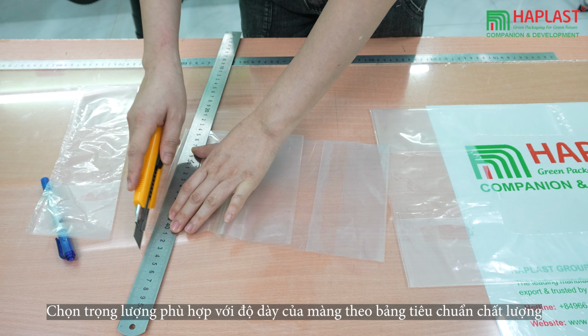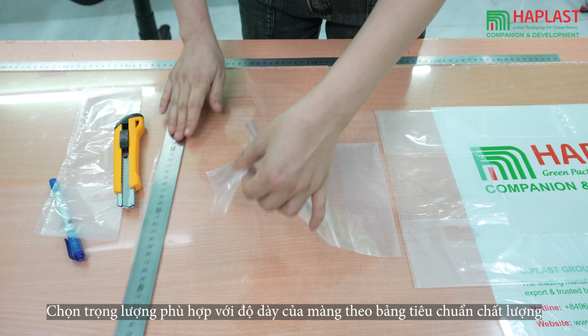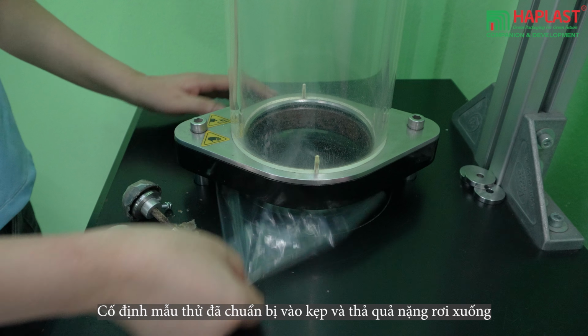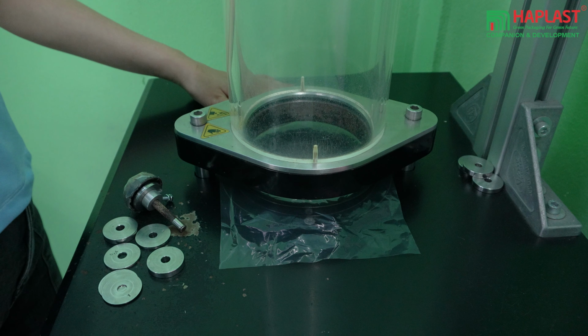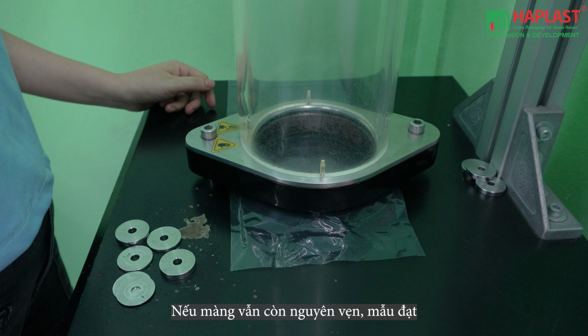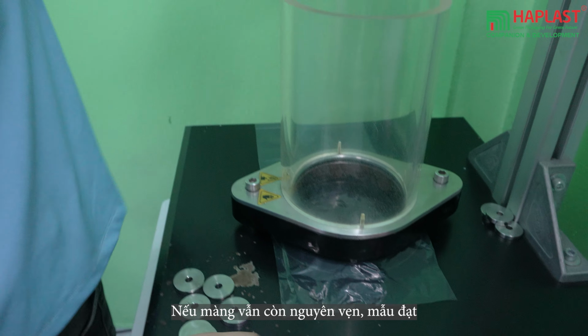Select a weight that matches the film thickness based on the quality standard chart. Secure the prepared test sample in the clamps and release the weight. If the film breaks upon impact, the sample fails. If the film remains intact, the sample passes.